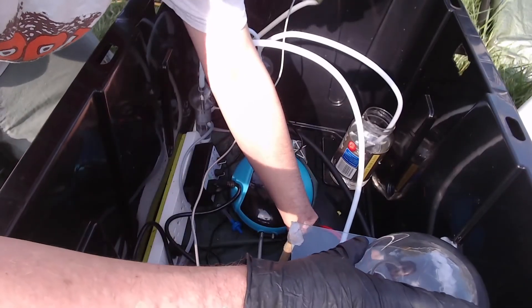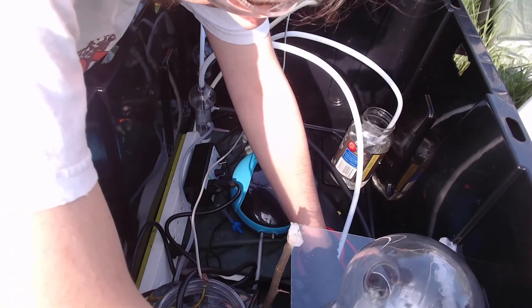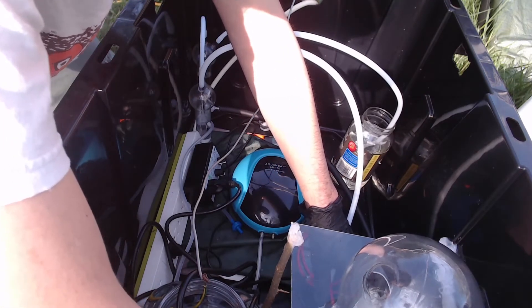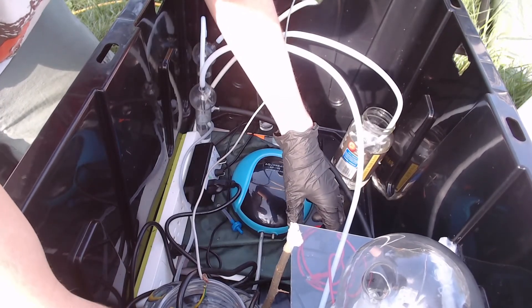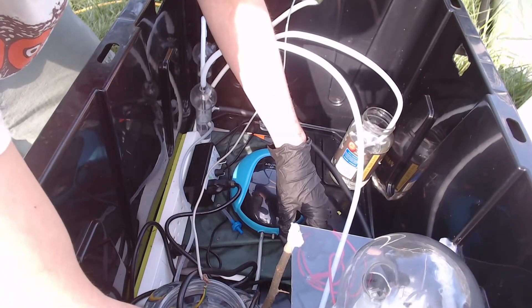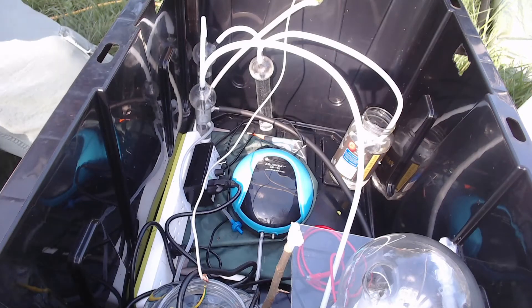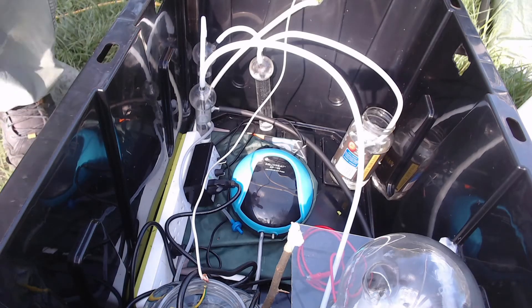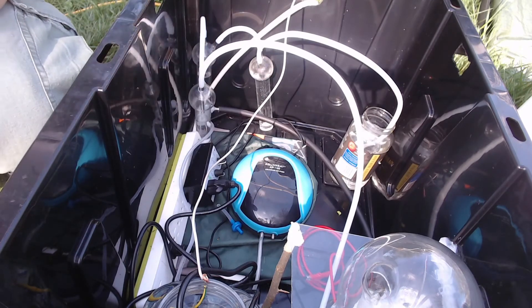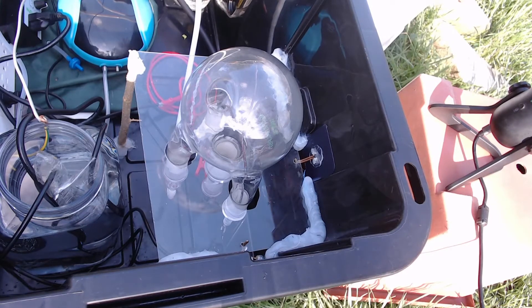Since I've taken it apart, something wasn't sitting in here right anymore — but there we go. Got the clips back on. We now have an electrical arc — you can kind of see it on the camera there.